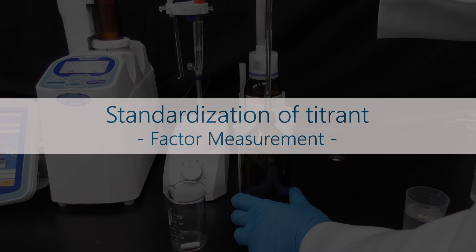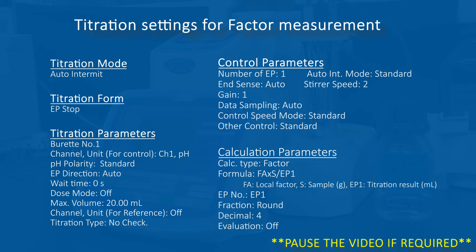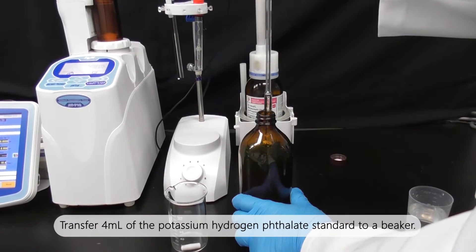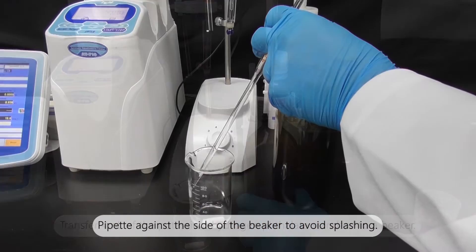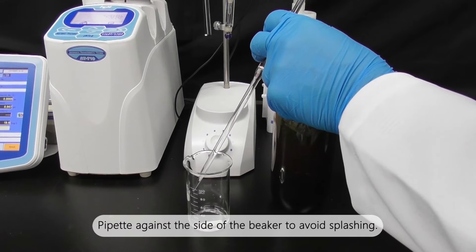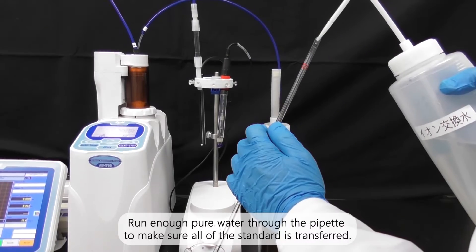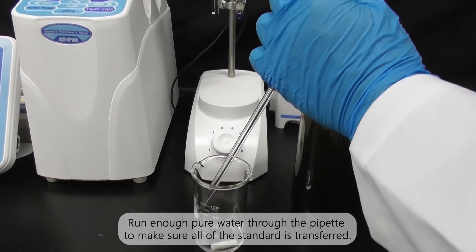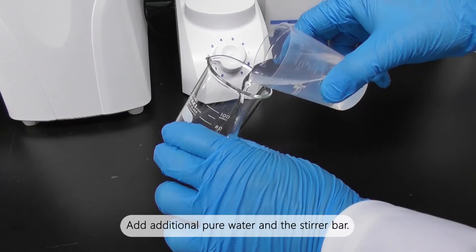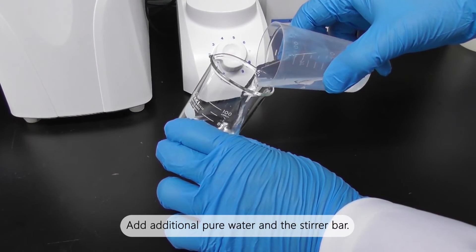Standardization of titrant, factor measurement: Transfer 4 mL of the potassium hydrogen phthalate standard to a beaker. Pipette against the side of the beaker to avoid splashing. Run enough pure water through the pipette to make sure all of the standard is transferred. Add additional pure water and the stirrer bar.